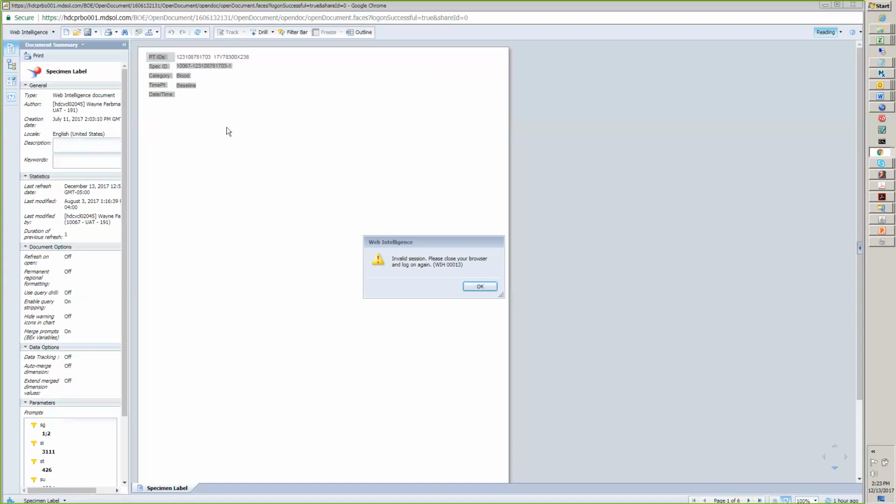Any questions from either of you about this? Nope. Just one sec. I want to look at something here. So okay, but so the treatment patient ID is not going to be on the specimen? That is how it is right now.